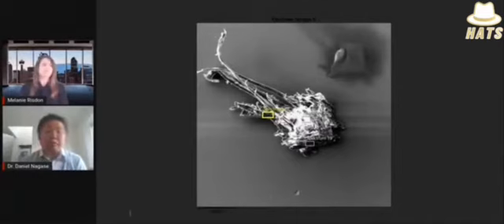And I thought to myself, well, is this mold contamination of a Moderna sample? But just as we saw before, we use the electron microscope to determine what elements are in the picture we're looking at. So there's 3 squares there. There's spectrum 20, spectrum 21, and spectrum 19. So let's scroll down and see what was included, what elements were in spectrum 19.